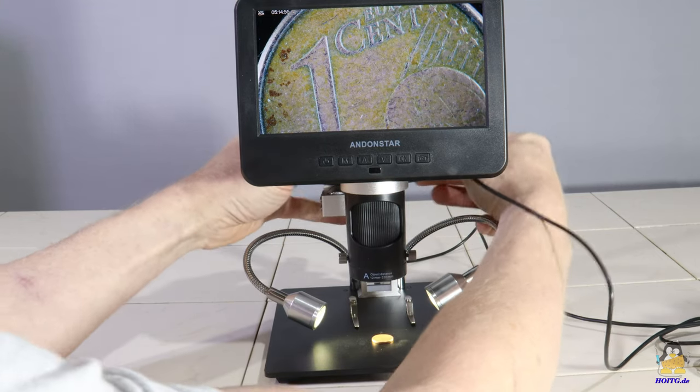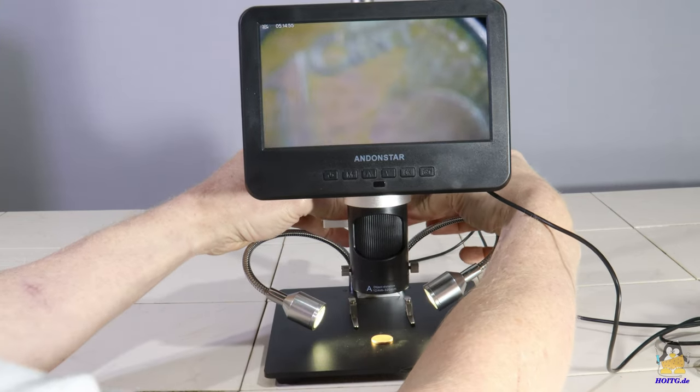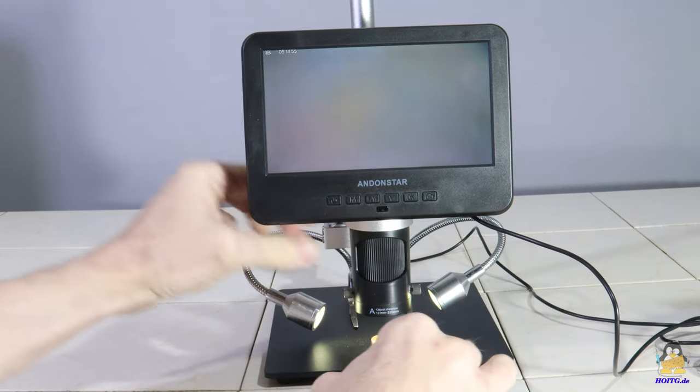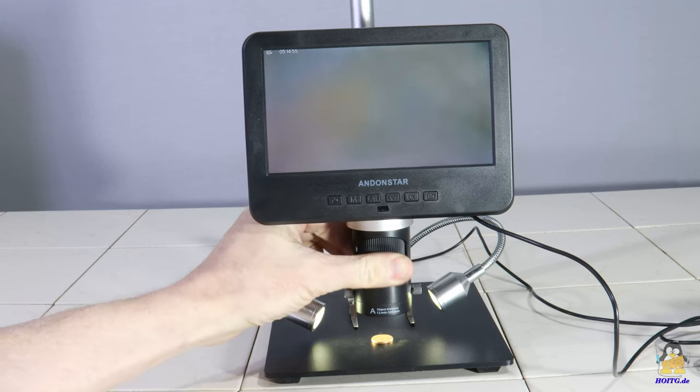Especially with a small distance, it is advantageous that the LED lights with a flexible attachment can also be brought close to the objects in order to sufficiently illuminate the narrow gap.